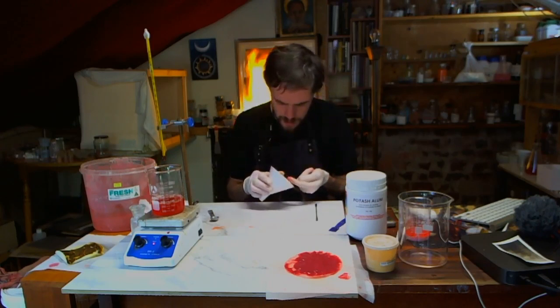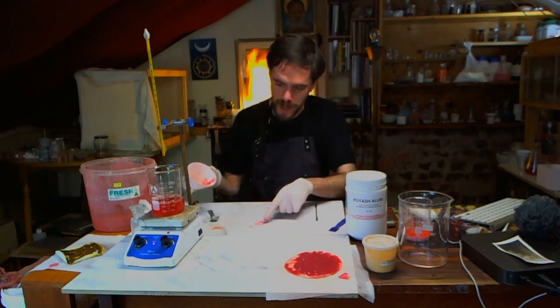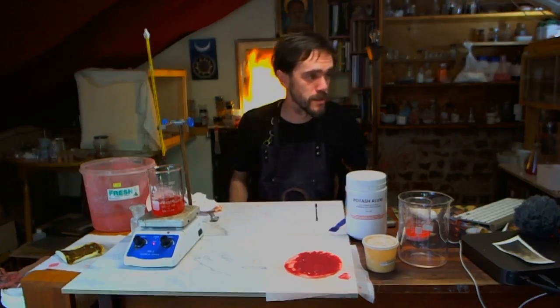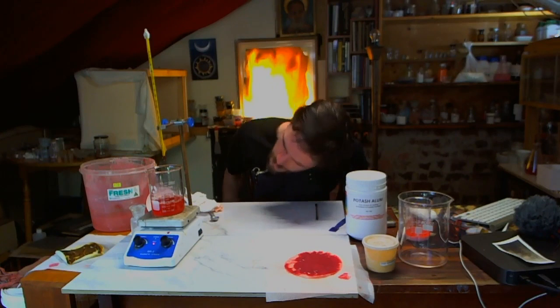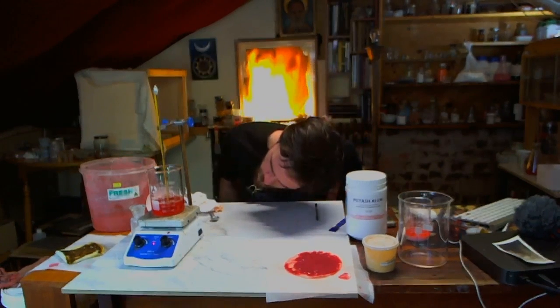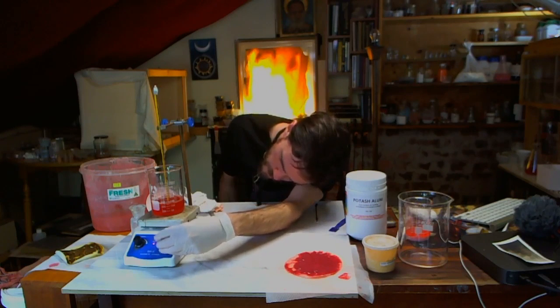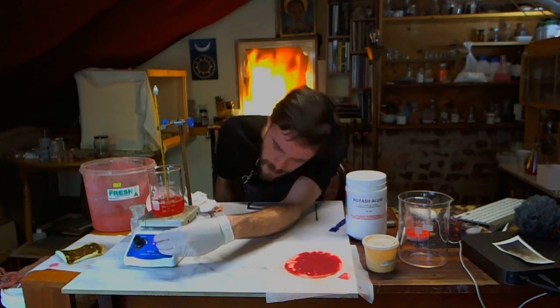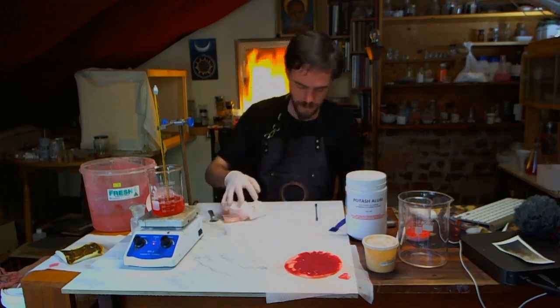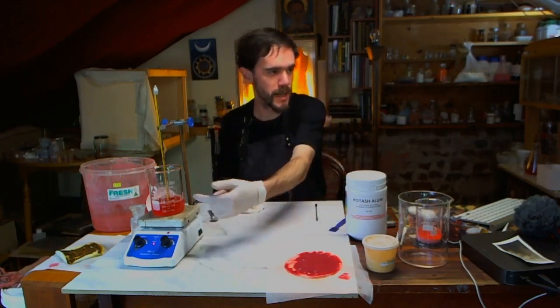It's interesting, there is a red sediment that's come off here, as you can see, which I'm wondering if that's partly the pigment coming out there. I'm not entirely sure. I may have made a slight mistake with this, but let's see what happens. Oh, we need this in there so we can keep an eye on the temperature. So we're at 50 degrees. And there is something precipitating out of here, which is really interesting.